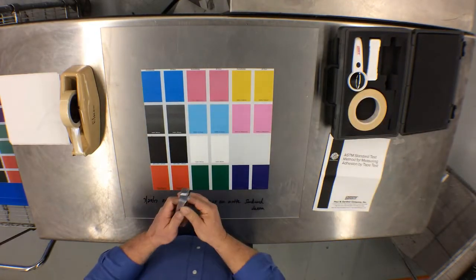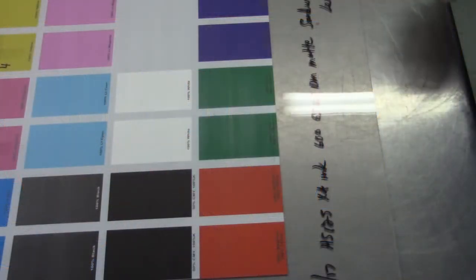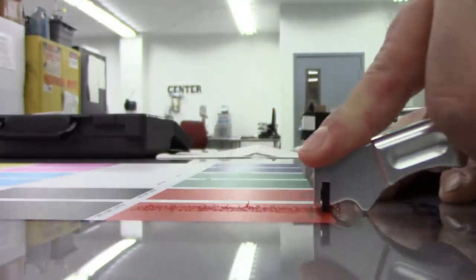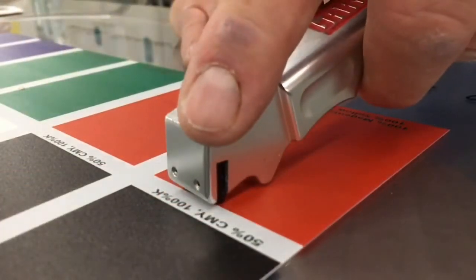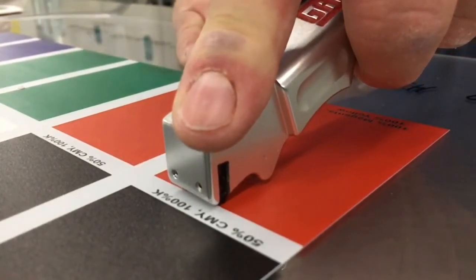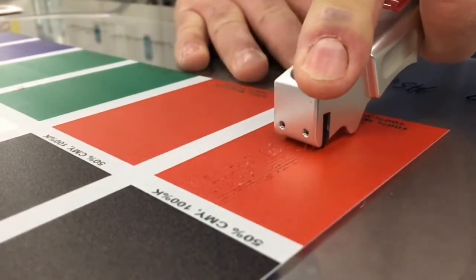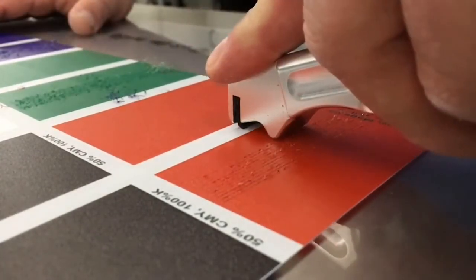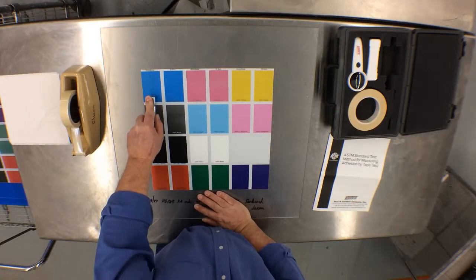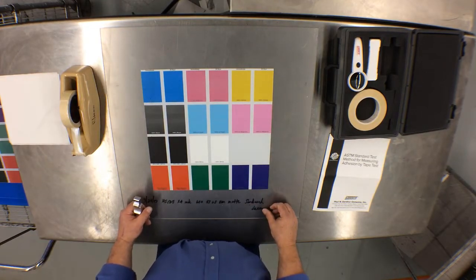Now that we've reviewed the equipment and the method we will use for UV ink adhesion testing, we are going to take this printed sample and, utilizing the blade holder, make two cuts on each one of these color blocks. The first cut will be made while holding the blade handle flat against the surface of the material and dragging towards us. The second cut will be made 90 degrees off from the first cut. Once the bi-directional cuts are complete, you should create a block with 100 small squares inside the block.